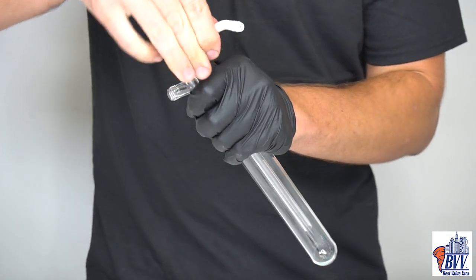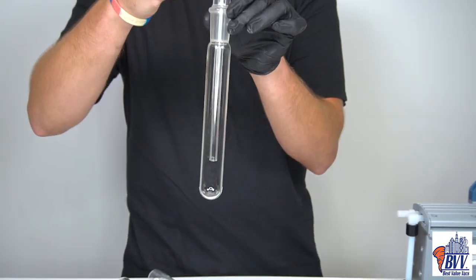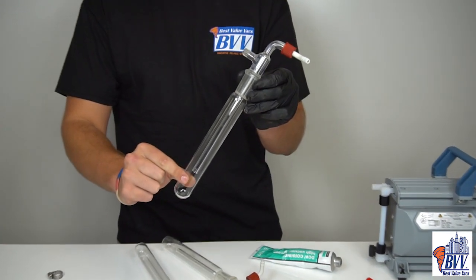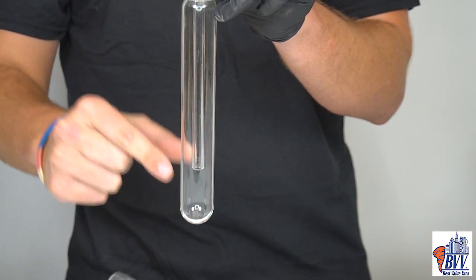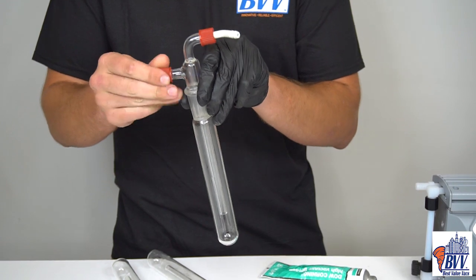So the way that these cold traps are designed is that it goes through the top and then it goes down this dip tube. So after that, all your vapors will condense down here because it will be submerged in cold liquid, and then your vacuum pump will pull from up here, which will not take any vapors with it.